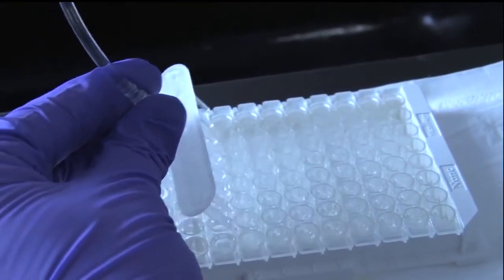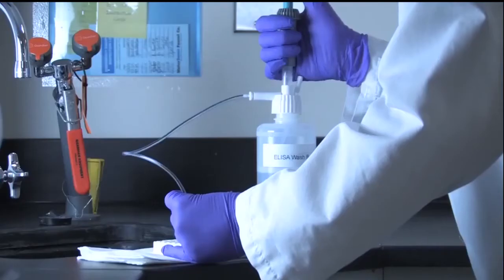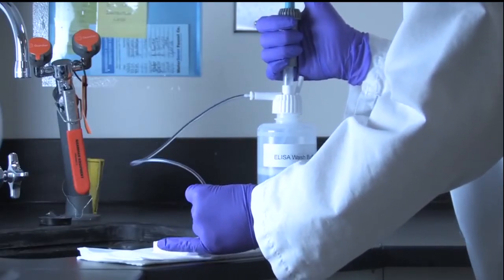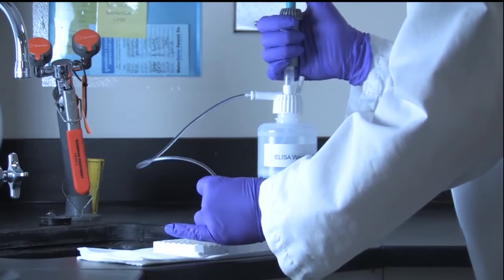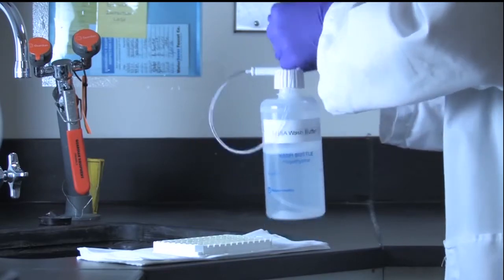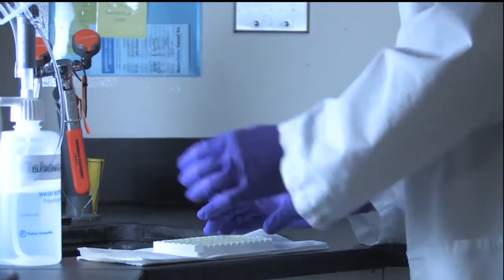Using the prepared wash bottle, fill all wells completely with wash buffer moving across the plate. Working methodically, the liquid should be dispensed with force in order to properly agitate the contents and remove any unbound material.